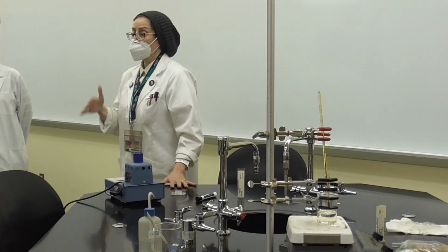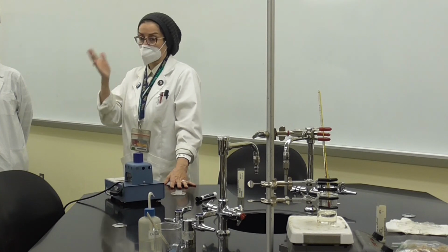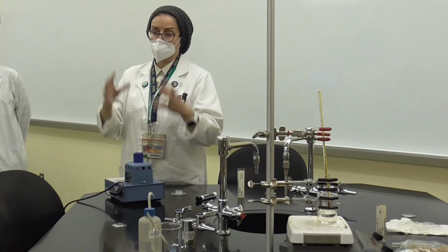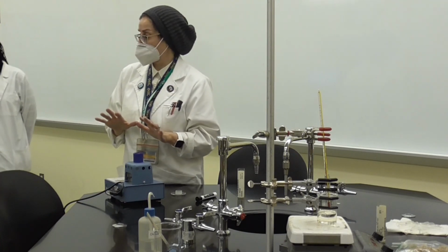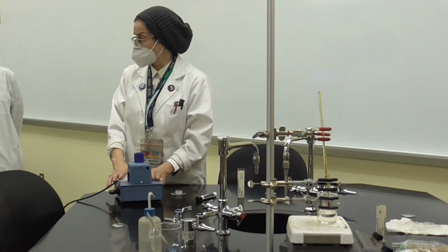Now, in organic or any chemical reaction where we prepare a chemical, after we extract it, purify it, and dry the powder, the first thing we want to do is measure the melting point.